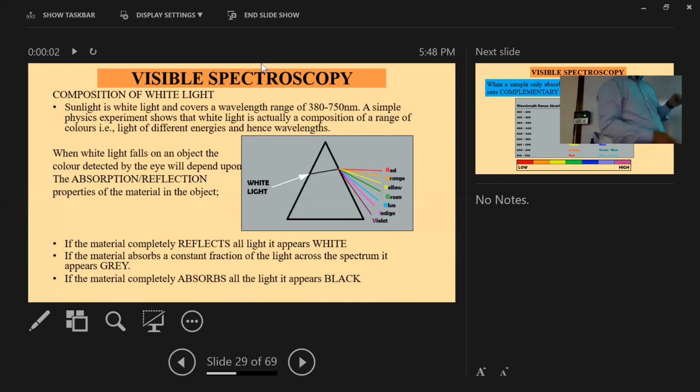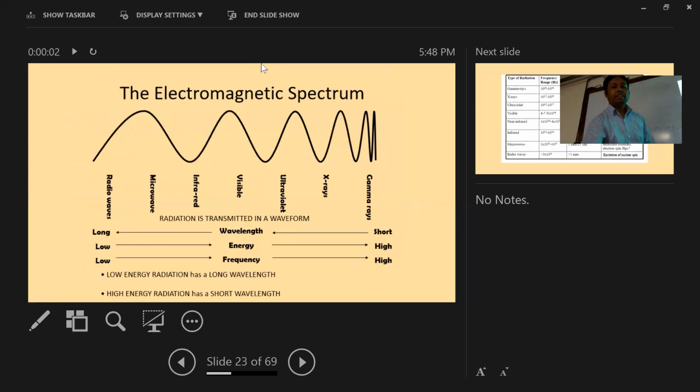So depending on the different wavelengths inside the white light, you will get different colors one after another. And if we see several bands of color together, we can consider that as a rainbow. So we are using that technology in the diffraction grating, what I have mentioned here.